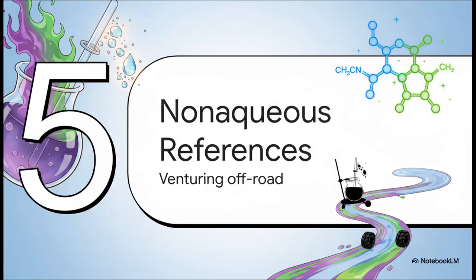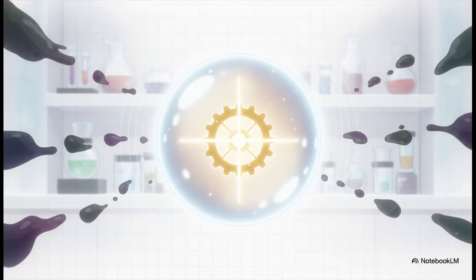Let's shift gears to part 5, pseudo and non-aqueous references. So, what happens to our pristine setup when we abandon water and go off-road into organic solvents like acetonitrile or dichloromethane? Well, aqueous reference electrodes are full of water and salts. In non-aqueous environments, they can leak water and chloride ions, completely cross-contaminating our delicate organic cell. To solve this, we rely on quasi-reference electrodes combined with an internal standard like ferrocene. Ferrocene undergoes a highly predictable, reversible oxidation that IUPAC specifically recommends as a standard redox couple for calibrating non-aqueous systems.